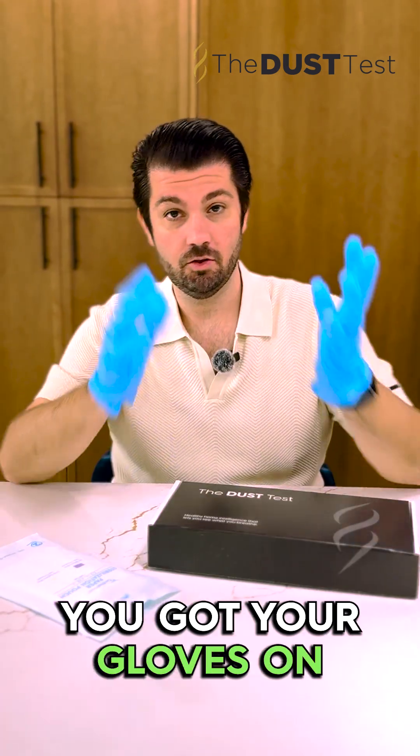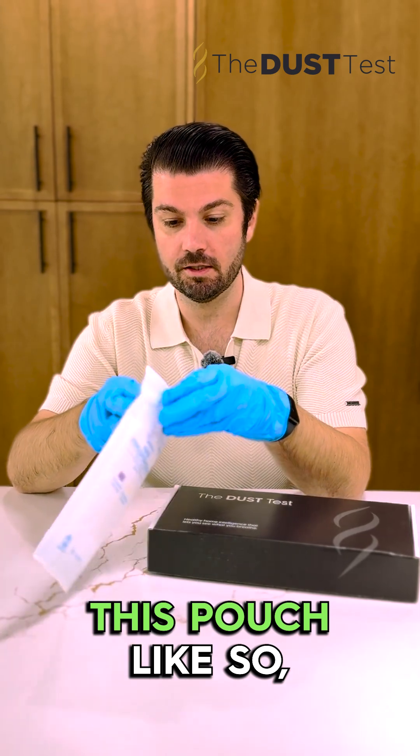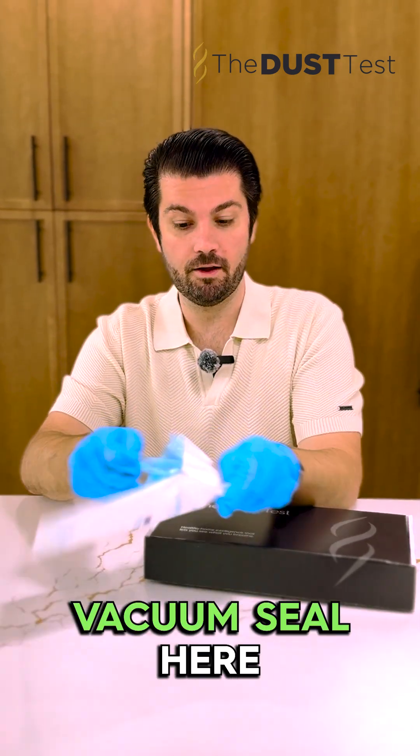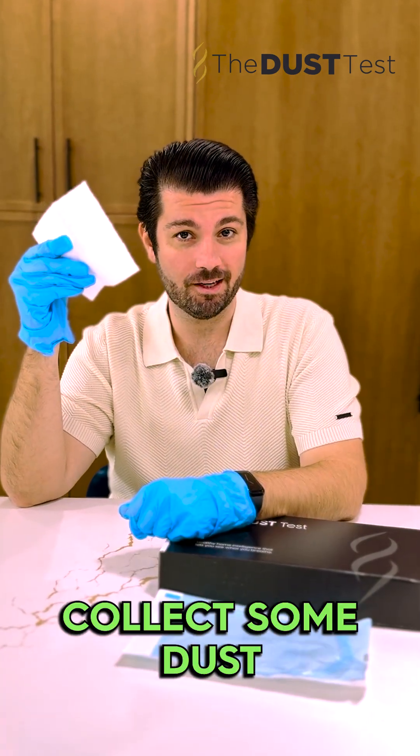Alright, so you got your dust test, you got your gloves on. You're gonna open up this pouch like so, and you're gonna break that vacuum seal here. Then we're gonna take this cloth and we're gonna go collect some dust.